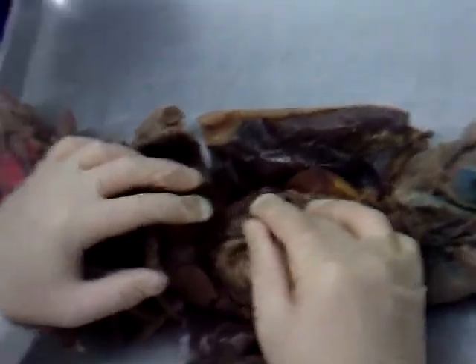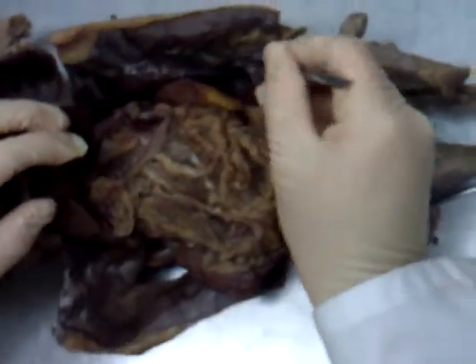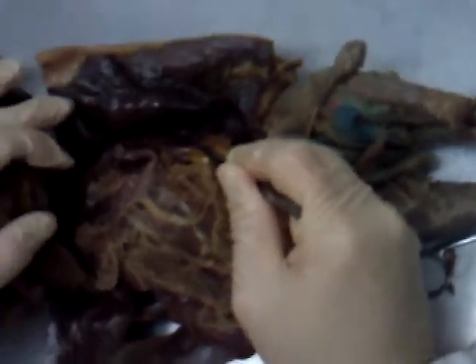Pull the liver up out of the way — the organ curving around in this fashion is the stomach. Pretty big stomach here. Before we pull the omentum back, the organ way out here, colored a little yellowish — that's the spleen.